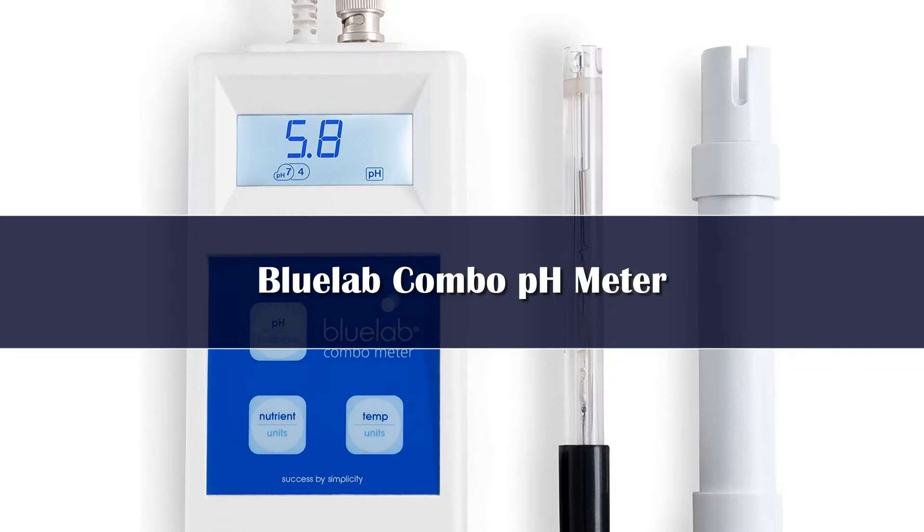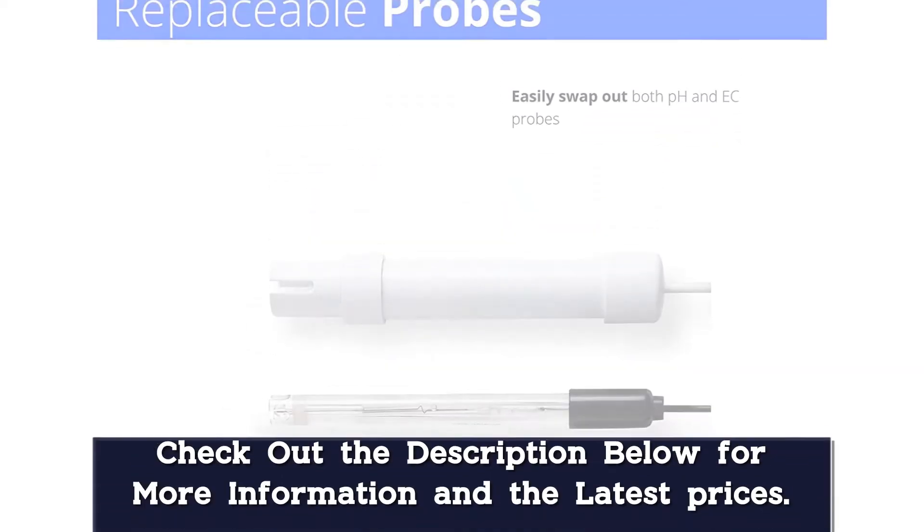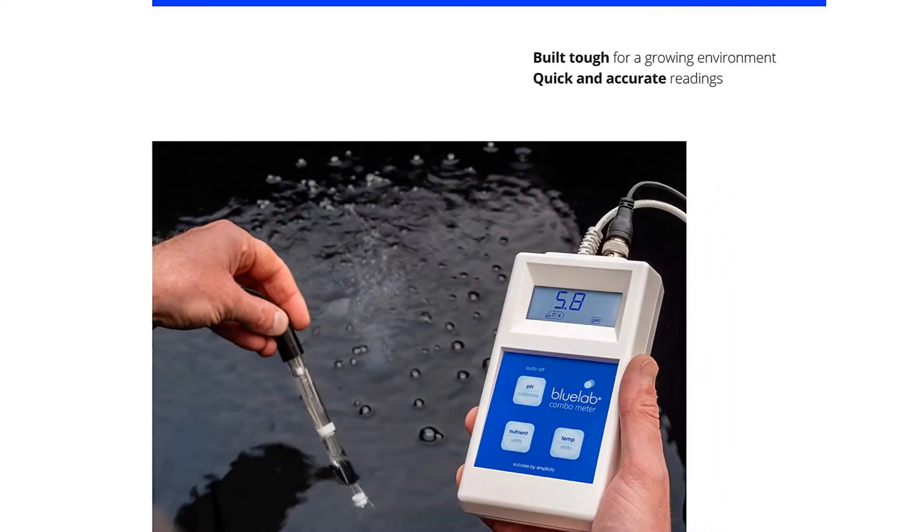Number 5: The BlueLab Combo Meter is the de facto standard in combination pH, temperature, and ppm/EC TDS meters. It's the one that I recommend most often, as well as the one that I find most growers to be satisfied with.